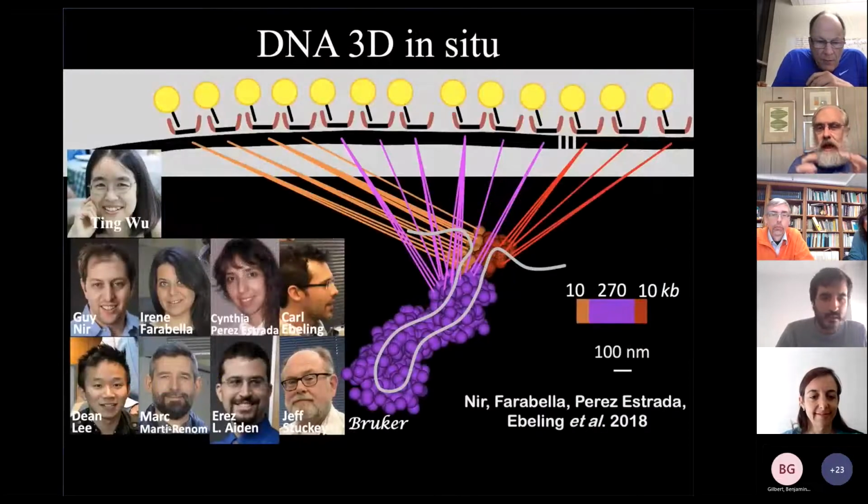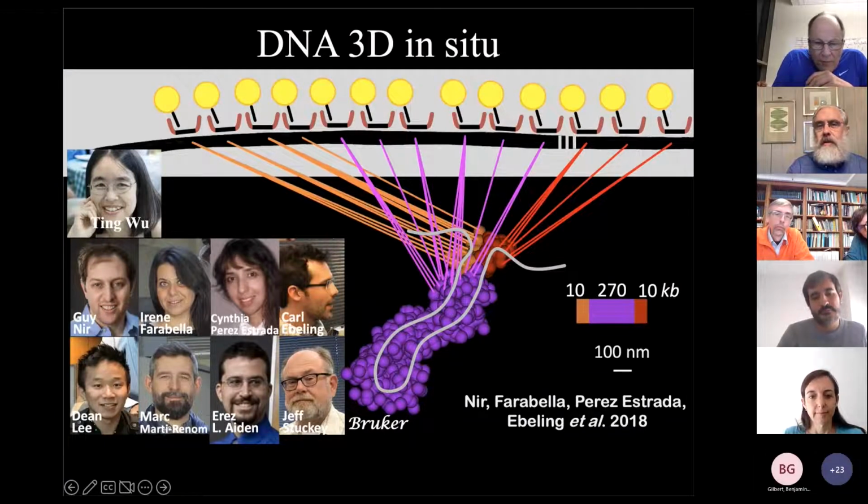So here's a kind of a zooming in on a particular loop. So this is one loop of the DNA. And you can see the loop closure by orange and red binding together region. These are 10 kb regions, and you can see multiple balls within the 10 kb. That's giving you some idea of the resolution here.